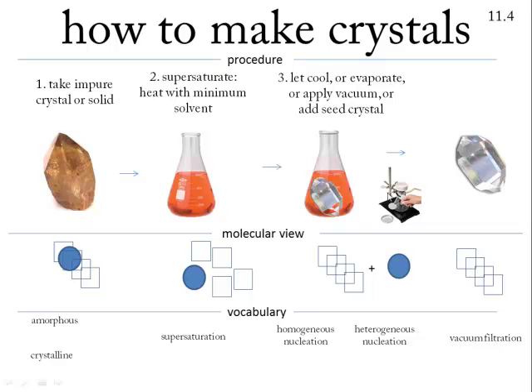Finally, all you have to do is collect it. This is a vacuum filtration apparatus. It's perhaps the best way to do it. It simply filters the material very rapidly by applying a vacuum. So you throw your stuff in there and it gets sucked through and the solid stays there, and you end up with your recrystallized product.